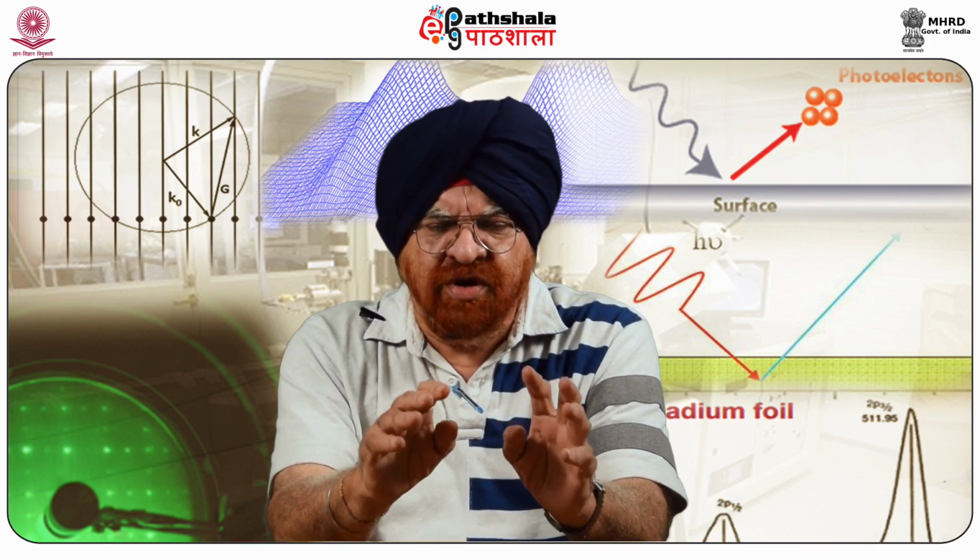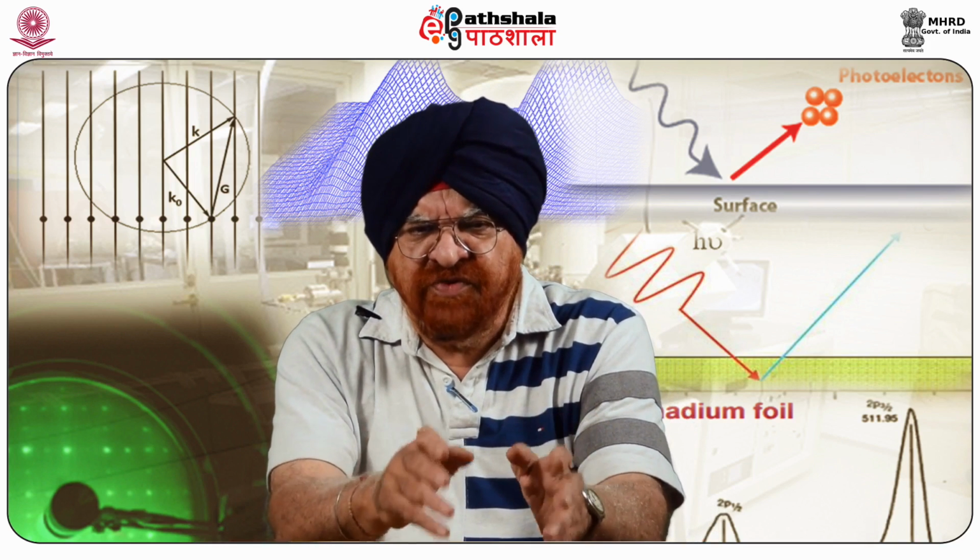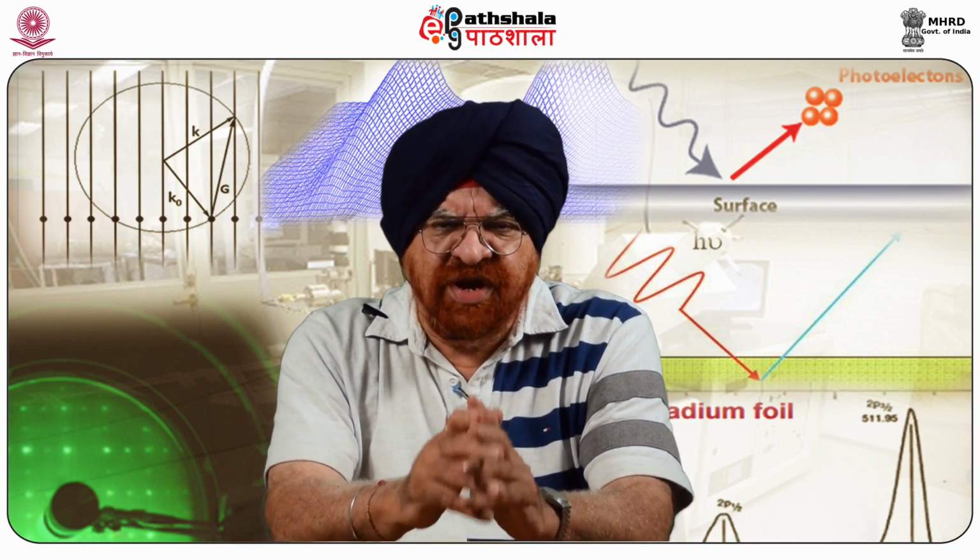Determination of surface contaminants on semiconductors is another great help that this equipment is able to render, and this goes a long way in the area of semiconductor research. Identification of active sites and poisons on the catalytic surfaces can be very accurately deciphered with the help of this, which is a great help in carrying out catalytic studies.